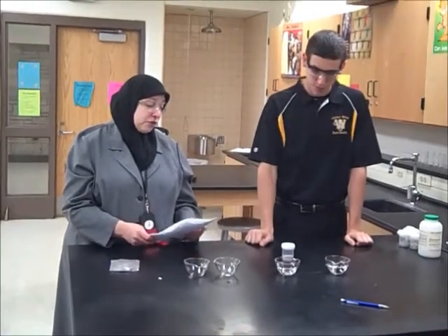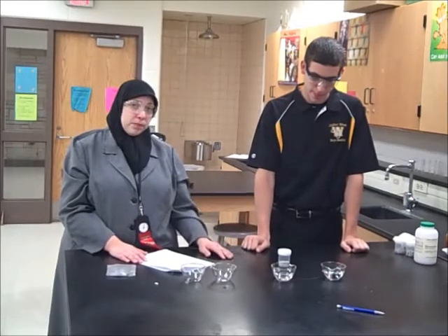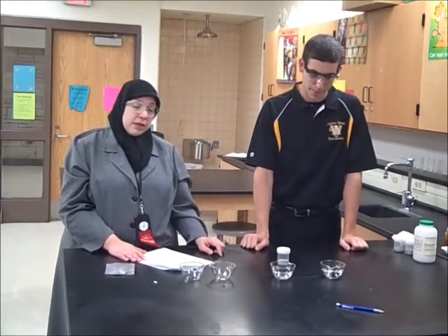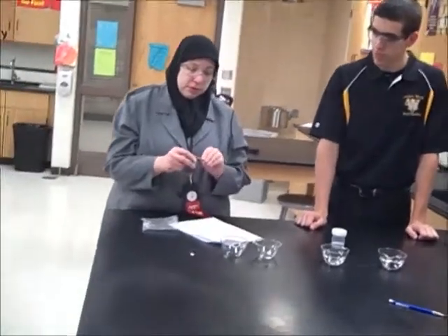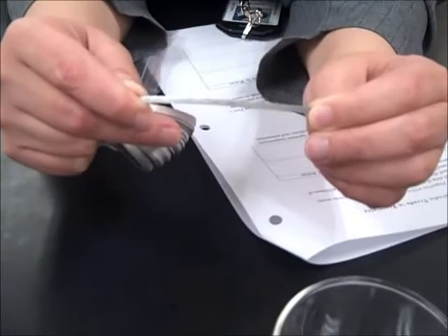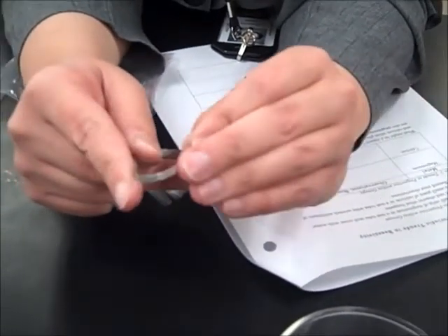The first part he's going to do is show the reactivity of metals in water. We have two metals. One is magnesium. So if you would come get a little close-up of magnesium. Magnesium is a soft metal. It's shiny and it's silver. Soft because I can bend it and break it off just like that.